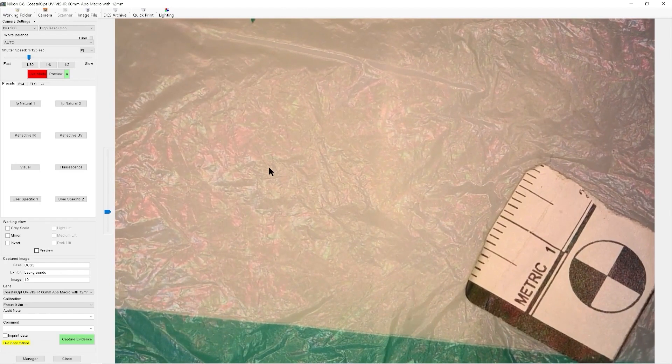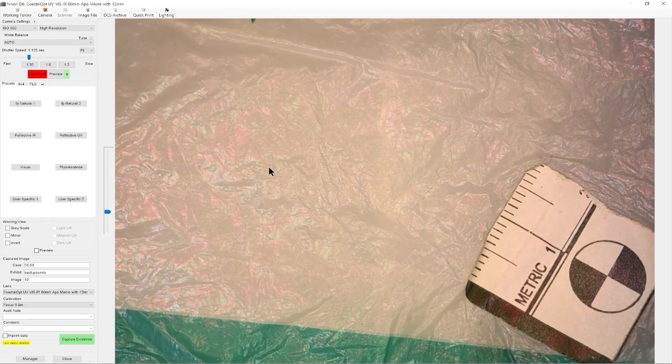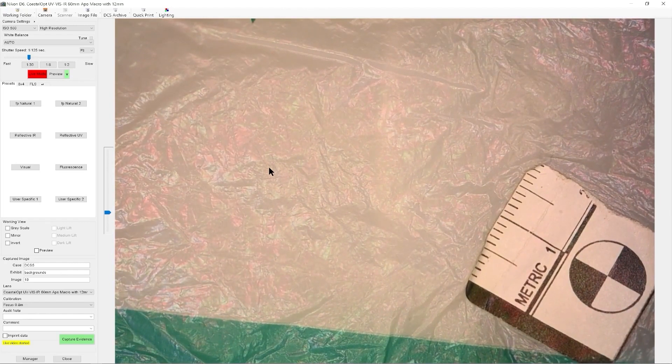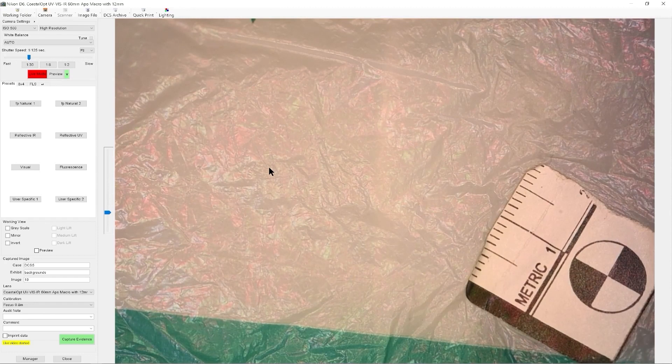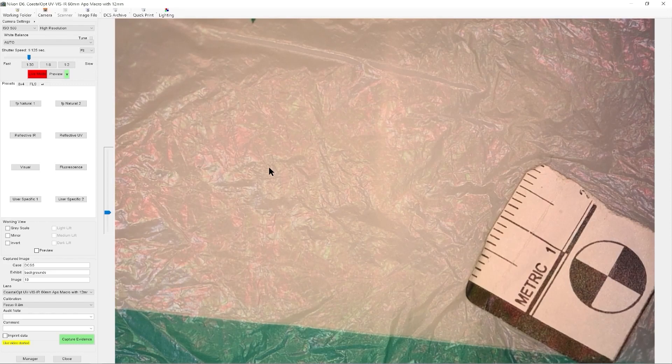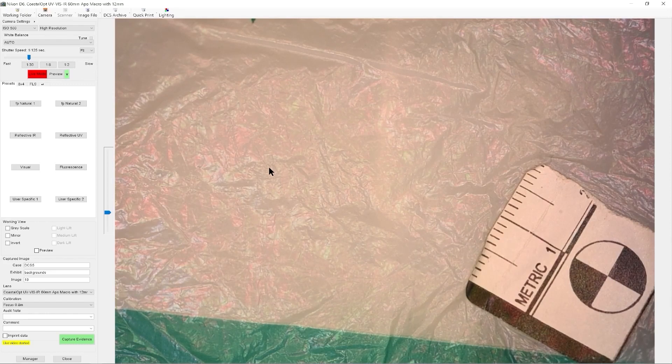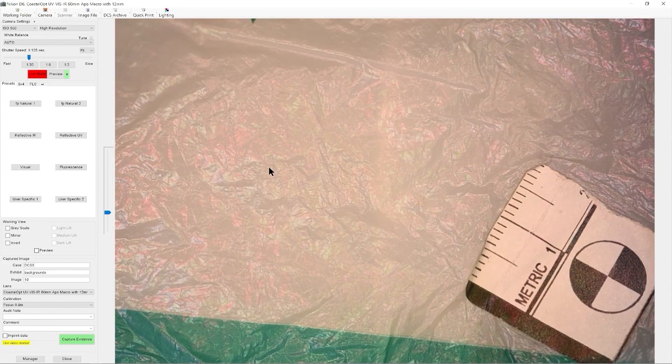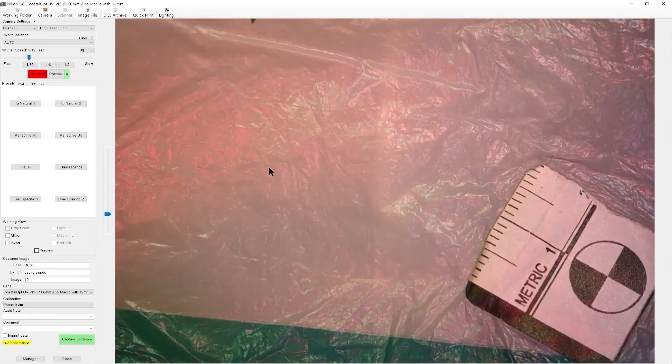Now we're using LEDs as a light source. The LEDs are in a circle, so they're giving me a really even illumination. I'm not having to hold the light guide in one particular area to try and see my fluorescence.